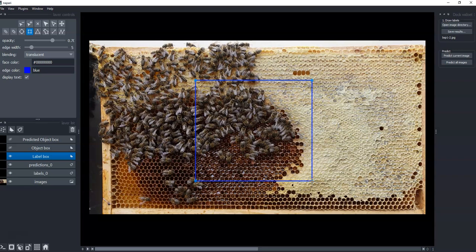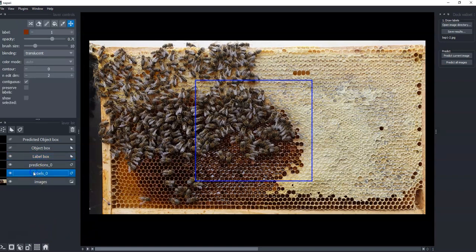We could probably do something clever like label parts of the image and then automatically detect. But I think it's better to be explicit, because you may really want to say, I don't want to label this part of the image, I just did this part, and make sure you make that decision instead of having some automated algorithm decide which area was labeled. Okay, so we've got a label box. Now let's label sparse labels.